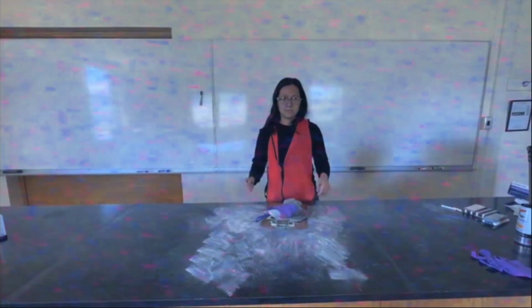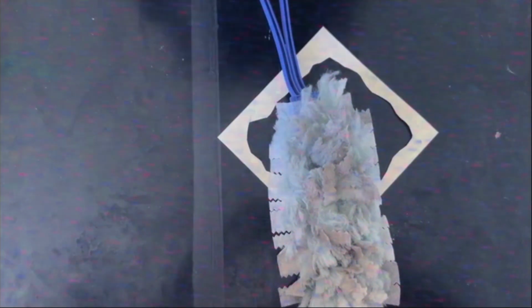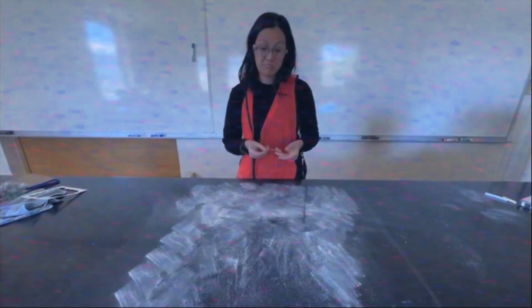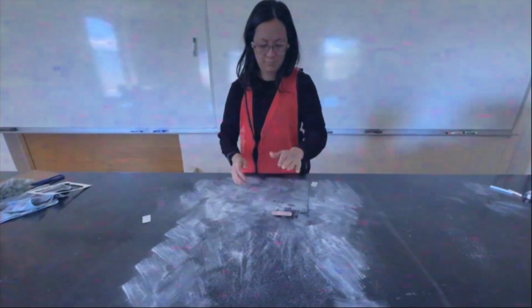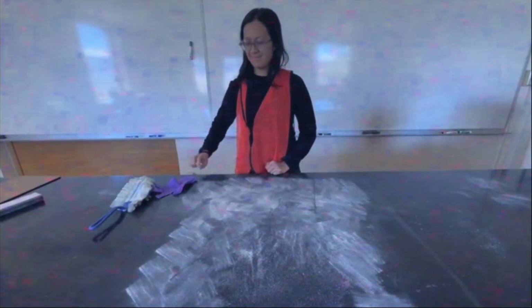Before sampling can begin, equipment must be assembled. Let's observe the equipment. A questionable template, a bandage, a feather duster, and a dirty cloth. These are not correct tools, and yet they are still being used. These items should not be used for settled dust sampling. Nevertheless, for educational purposes, we will now observe what happens when proper guidance is ignored.